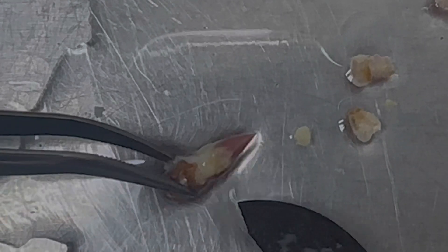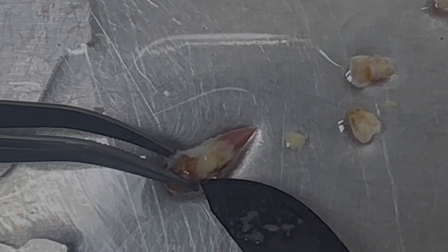One technique to propagate Nepenthes or to introduce Nepenthes to tissue culture is by using hormones like cytokinins — like kinetin or BA — to induce new lateral shoots. That way you can just take the lateral shoots and try to do the sterilization this way, so you don't end up essentially sacrificing the entire plant.